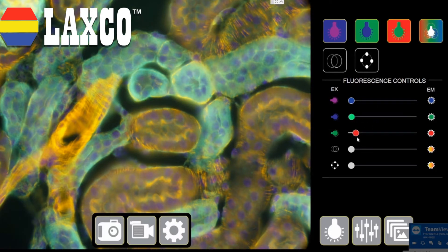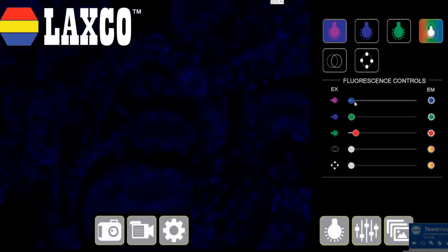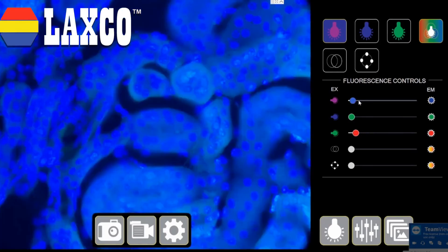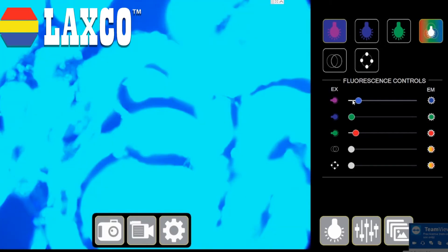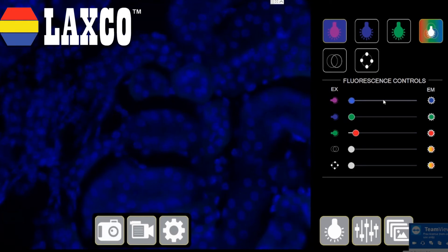Let's look at the other functions. This is my intensity controller. I can choose to decrease or increase the intensity of each channel. Let's turn on only the DAPI and take the intensity up. As you can see, it's optimized for my samples. If I turn it up too high, it starts to get bleached. But depending on your sample, if the dye absorption is not great, you can always bump up the DAPI signal and make that dye bright.